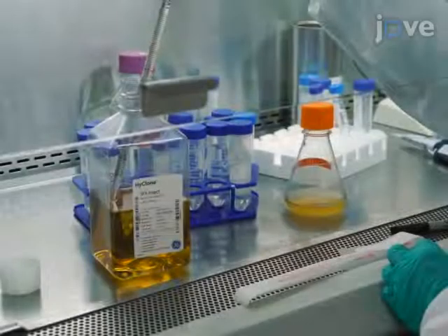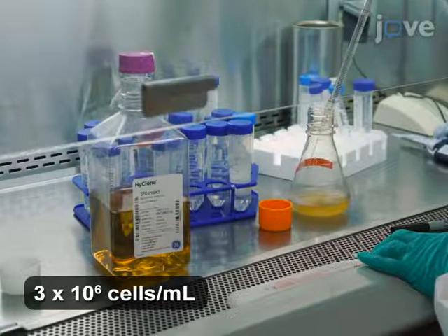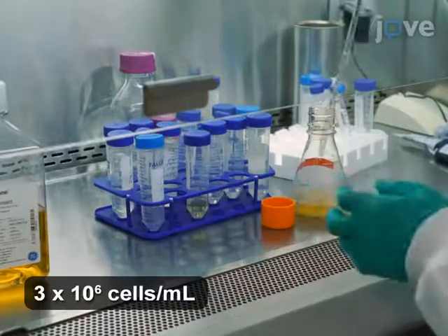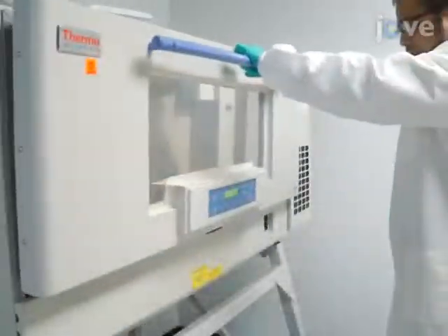To set up the suspension culture, seed 50 milliliters of SF9 cells in insect culture medium into a 250 milliliter polycarbonate Erlenmeyer flask and place the flask in an orbital shaker incubator.